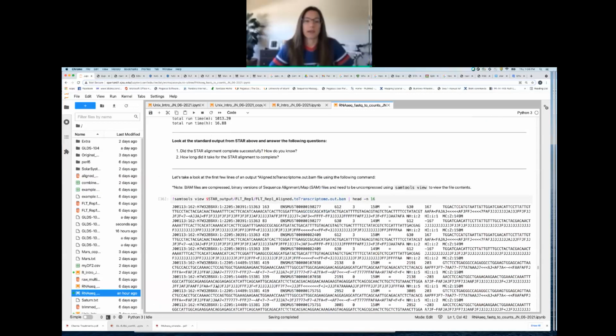So what we could do is take our BAM files and take column 10 and do a cutoff range so that we only take the rows that have in column 10 less than 20 base pairs. And then we can kind of subset our BAM file that way. And then we could take a look at that subsetted BAM file and then look at the gene ID or transcript ID in this case, and be able to know if all of those shorter reads were mapped to the same gene or not. That's a good point.